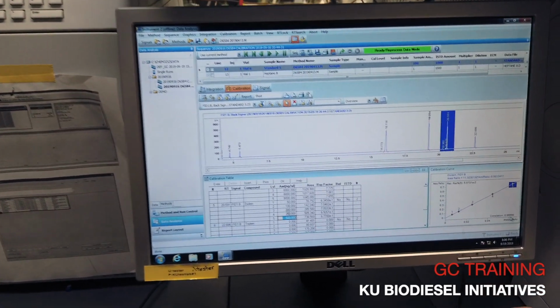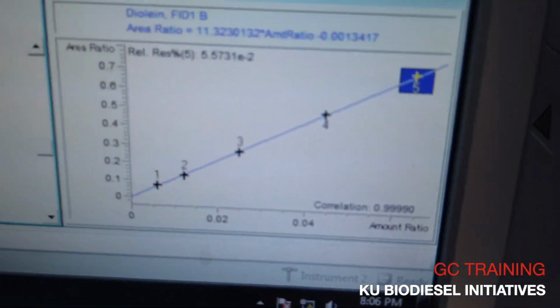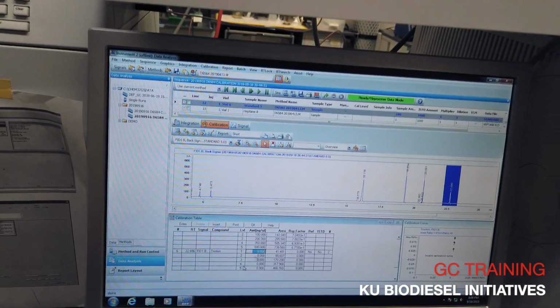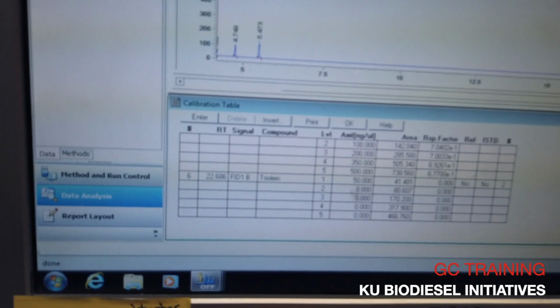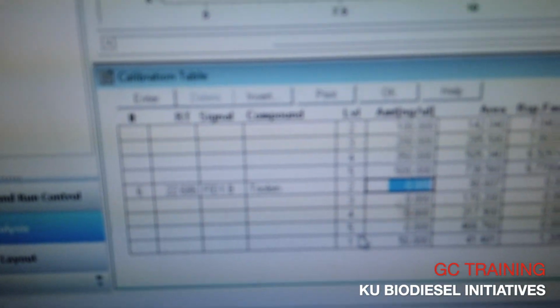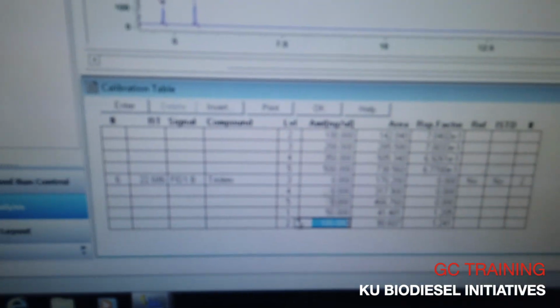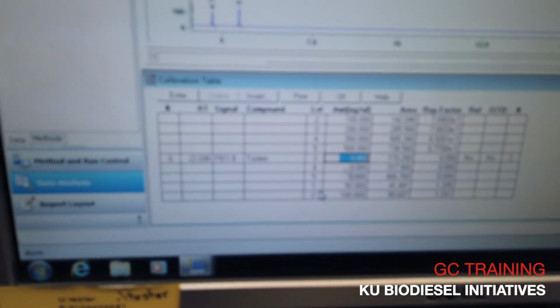Okay, that one's pretty good, too. That one's got 4 9s. Nice. Yeah, be excited. Yeah! There it is. Woo! Yeah, get this in the video. Woo!